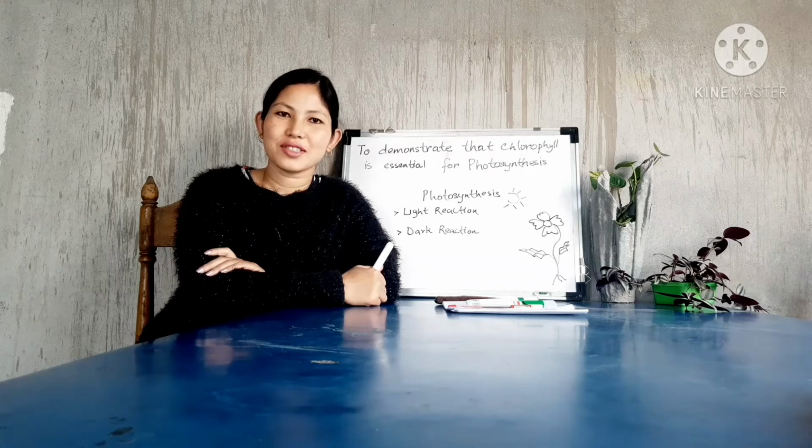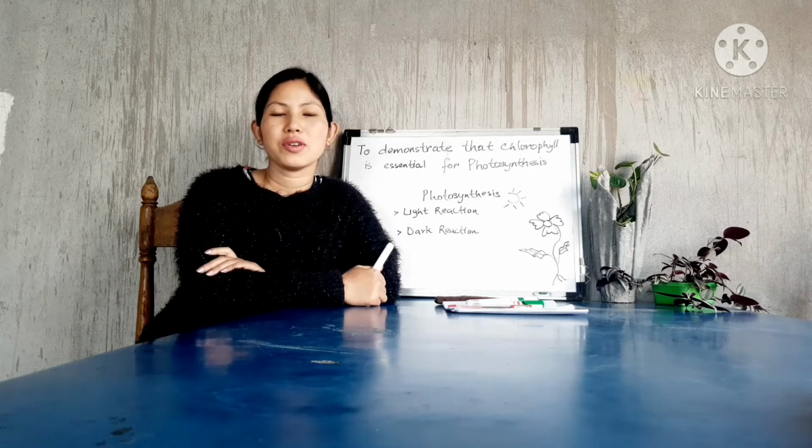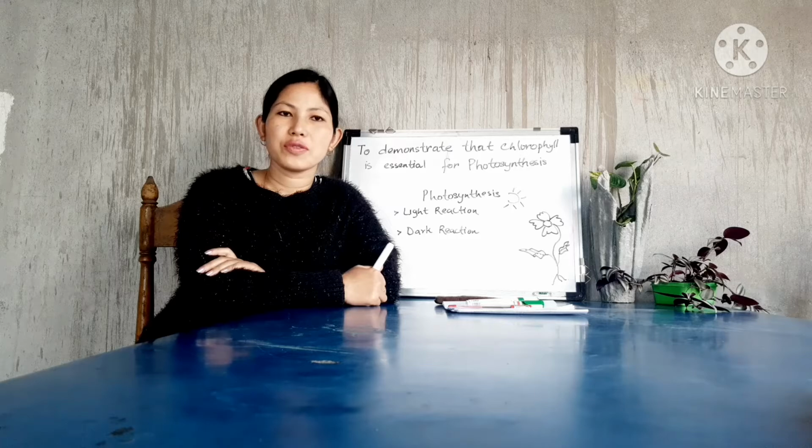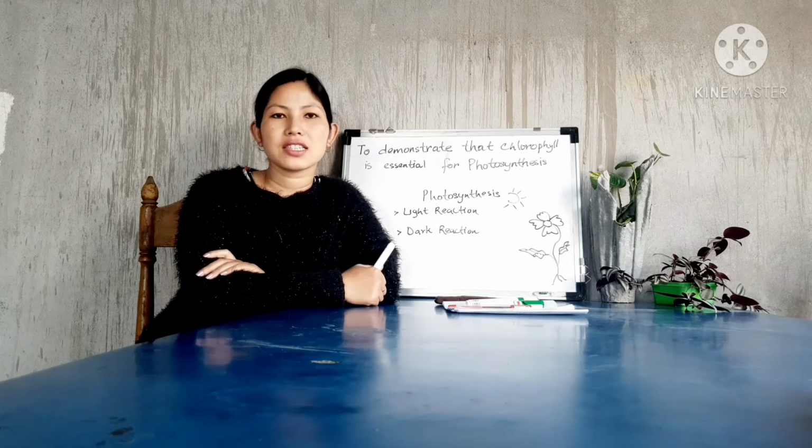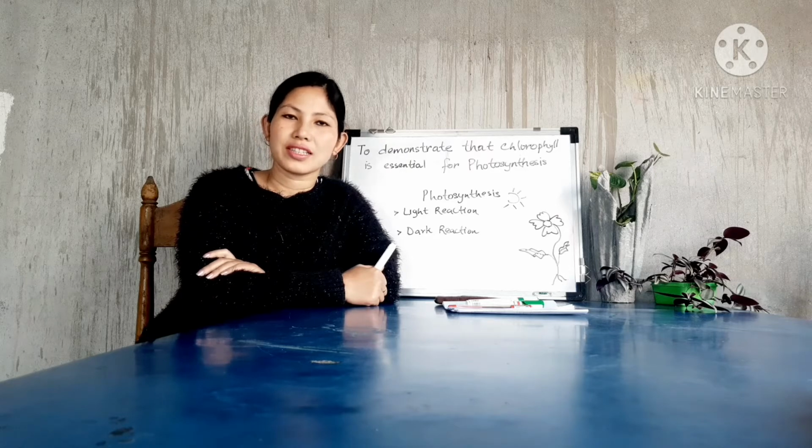Hello dear learners, today in this video we are going to demonstrate that chlorophyll is essential for photosynthesis. So before we begin, let us understand what is photosynthesis. Photosynthesis is a process by which green plants can synthesize their own food with the help of inorganic sources such as carbon dioxide, water, etc.